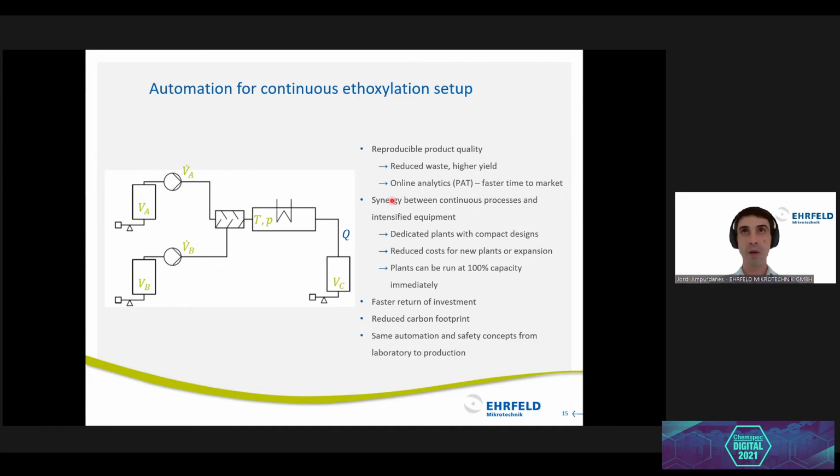In this way, a setup like one might have in the laboratories for a continuous process, like this one I'm showing here, can be fully automated, meaning that, for example, we would have pumps that require a certain flow rate to be defined, and also, for example, the volume of the reagents that has been spent can be calculated.